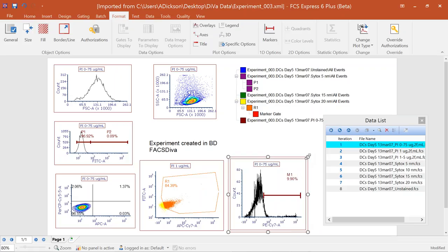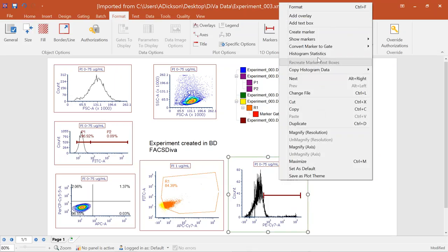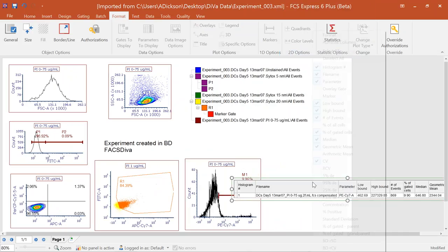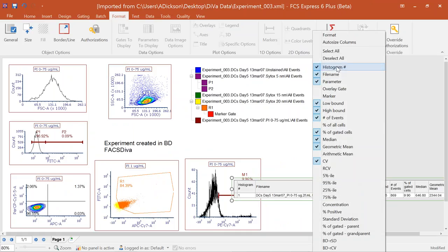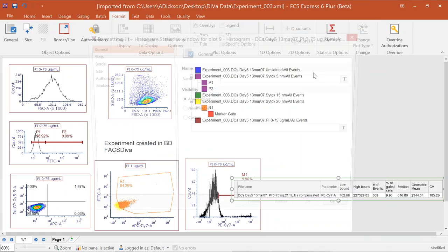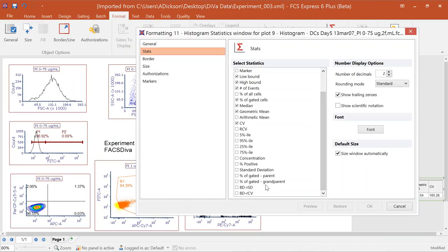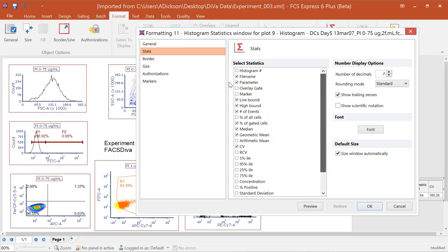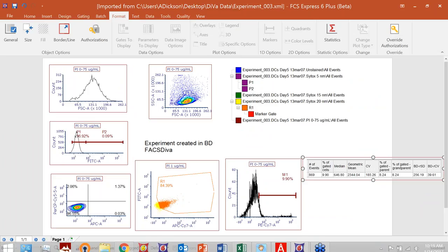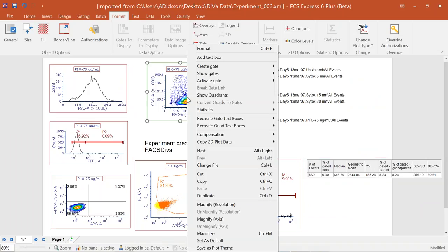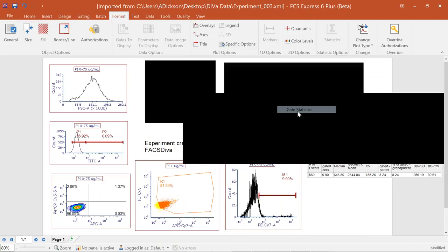While the statistics from DIVA aren't imported directly, all statistics are available within FCS Express. Simply right-click on a plot and choose Insert Statistics Table. For a histogram, all default statistics are brought in. You can also format the table to include BD robust standard deviation or CV values, percent parent, gated populations, and grandparent statistics — just check or uncheck the options as needed.